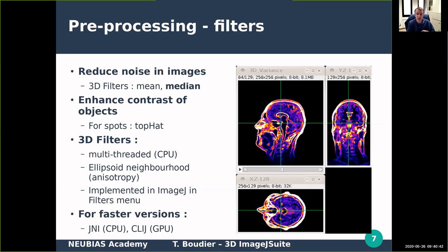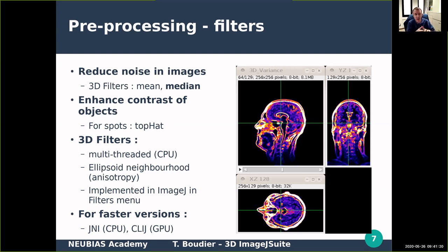We started with filtering because at the beginning in ImageJ, it was mostly 2D. We wanted 3D filtering — from one pixel, to get the neighborhood in 3D, not 2D slice by slice. Because if the noise is 3D, you want to average the noise in a 3D sphere or ellipsoid, not in a 2D slide-by-slide manner. For 3D filters, we use mostly the median filter for fluorescence images. You take one pixel, take the neighborhood in a 3D ellipsoid — the size may be different in X, Y, and Z — and do the median or mean. The Gaussian filter is not part of 3D Images but is also a great 3D filter.